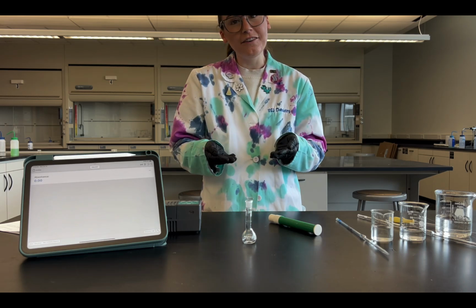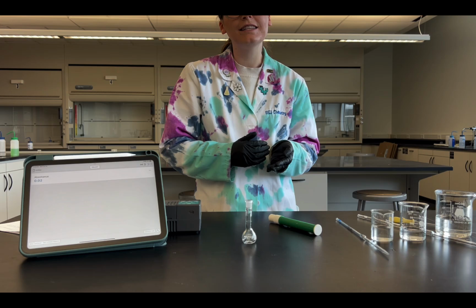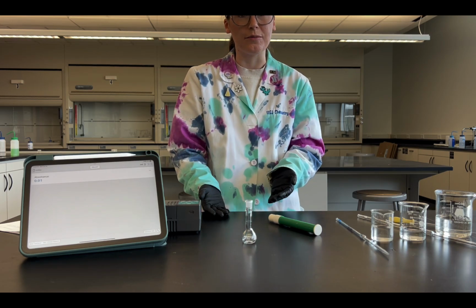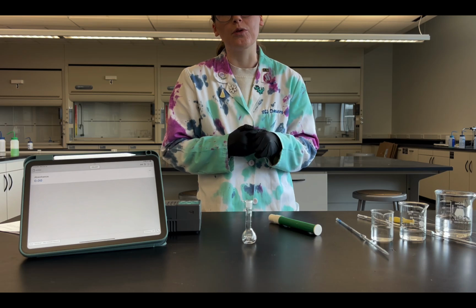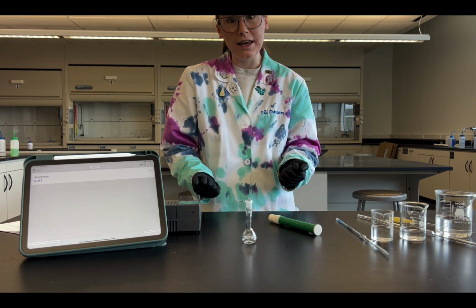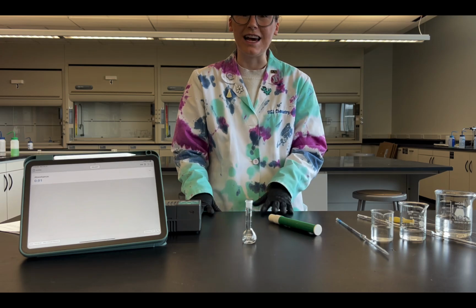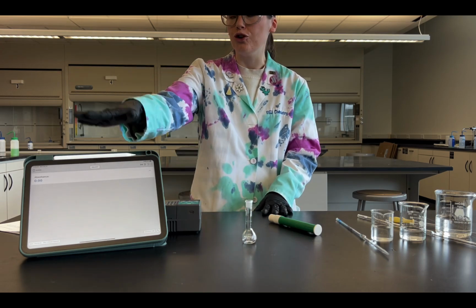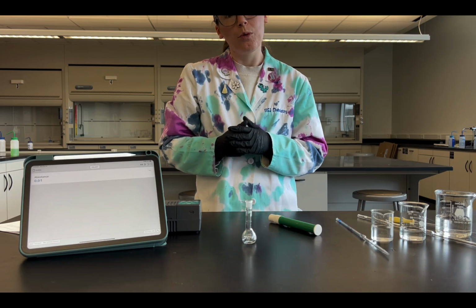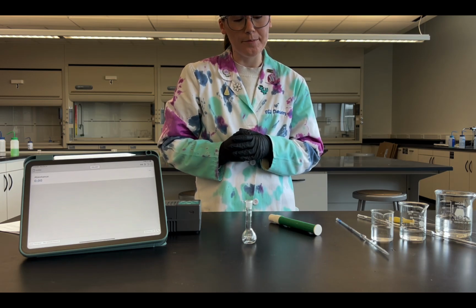What you're going to do after that is then do the remaining test tubes. Obviously, you'll do this test tube with your absorbance that you got from LabFlow, but then you can do the remaining ones by yourself because it is really repetitive. The calculations are the exact same. You just have to change your absorbance value and your concentration numbers, and we'll talk about that when we get into the calculations portion of the lab.